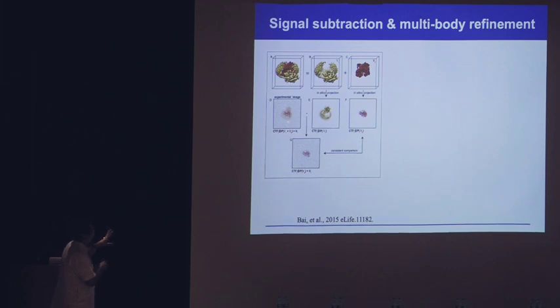And suppose this is an experimental image. Now you can subtract this noise, or you can say that this is the region outside your signal, like this. And if you subtract the outer region, it will become like this. So the region outside what you are focusing on is almost close to blank. That helps in better alignment. Obviously, this image can align better to this image compared to this image. This is how the signal subtraction works, and it was successfully done by Shore's group in 2015. Subsequently, a lot of people have used it.